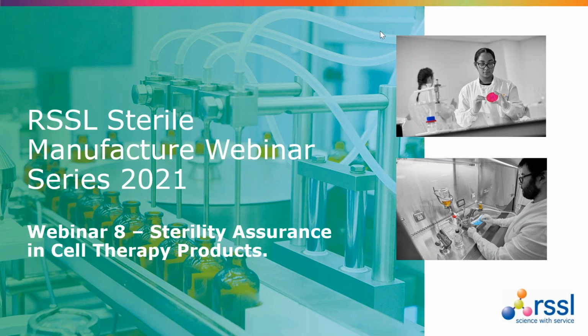Today's topic will cover sterility assurance in cell therapy products.